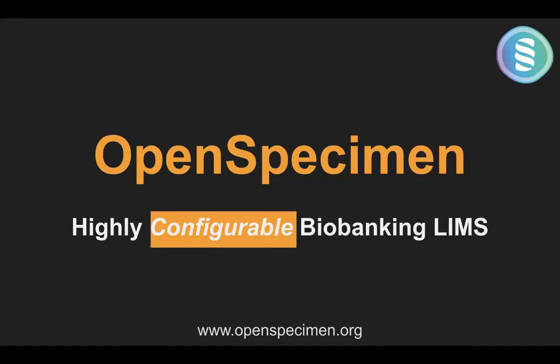The goal here is to talk about OpenSpecimen at a very high level and also give a short live demo just to give you an overall feel of the product. And if you're further interested in learning more, you are welcome to email us and we can have a discussion one-on-one about your requirements and how that can be met with OpenSpecimen.